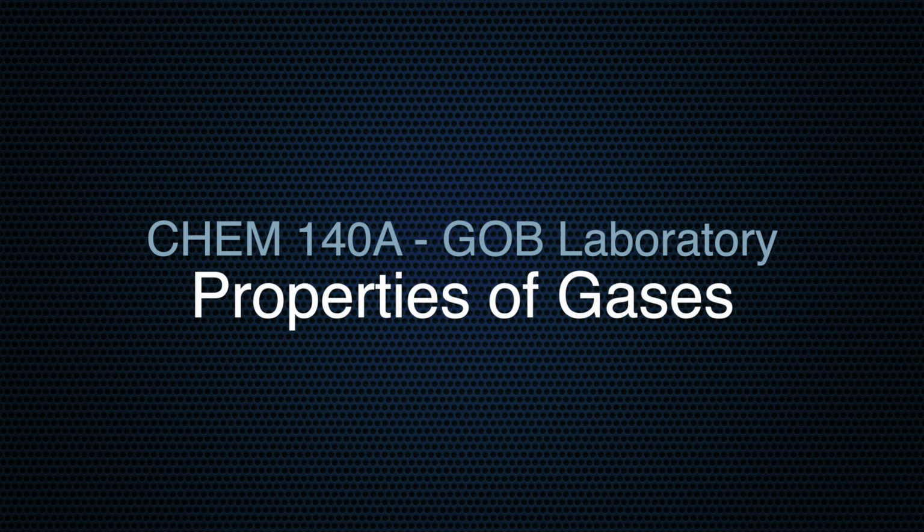Welcome to the GOB laboratory at Mercy University. In this experiment, we'll take a look at how gases respond to changes in volume and temperature.